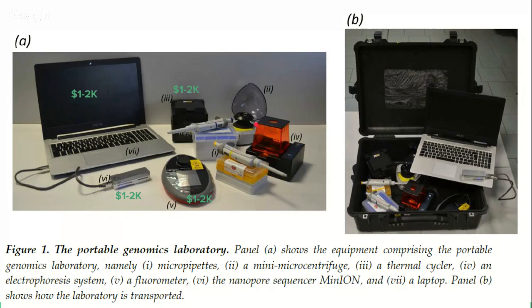What's not shown here are the reagents, I mean, apart from the tips, but these would go inside the boxes and at different temperatures as required.